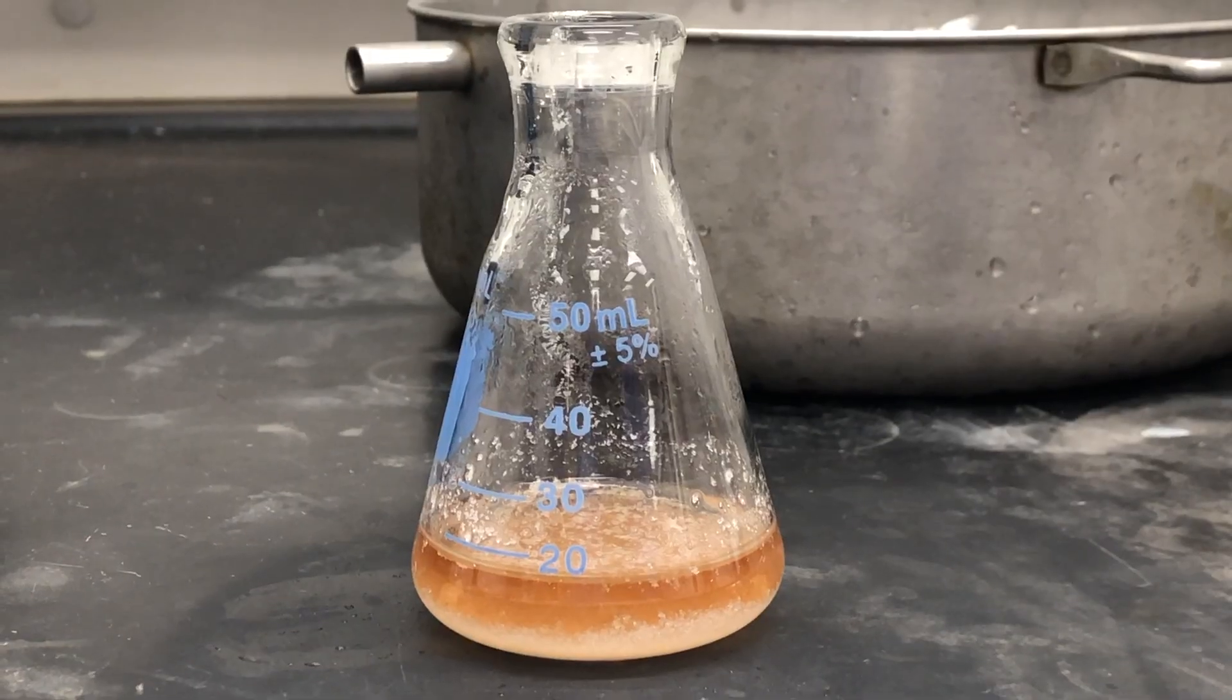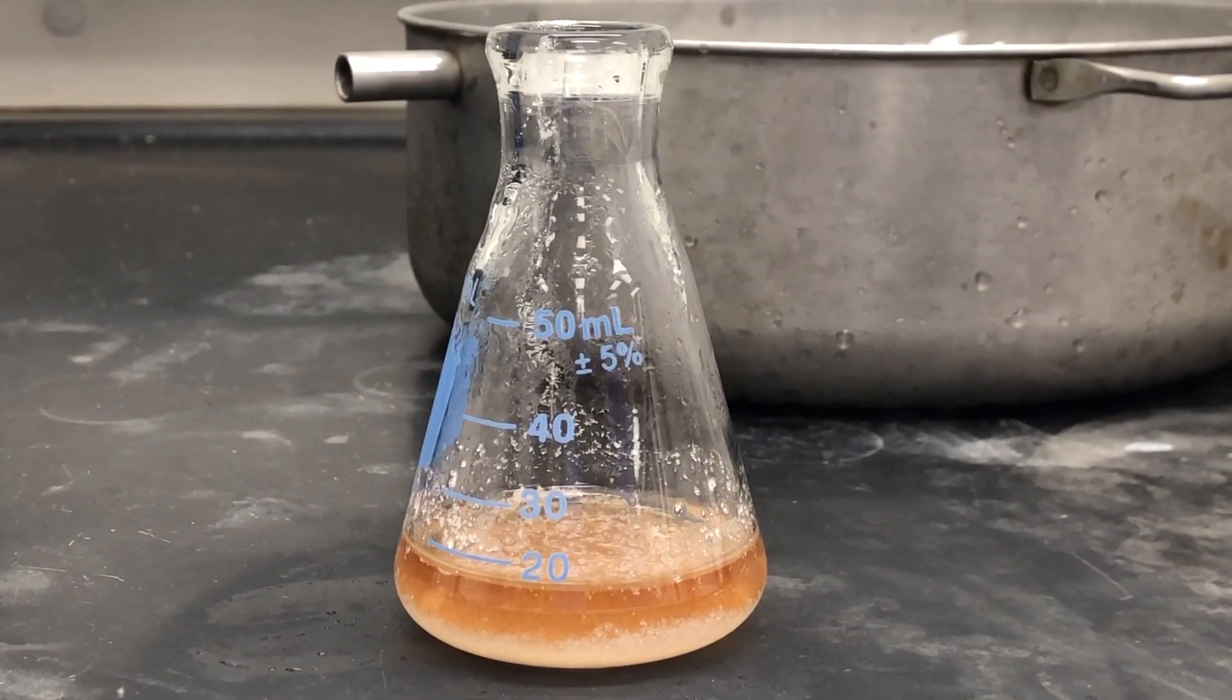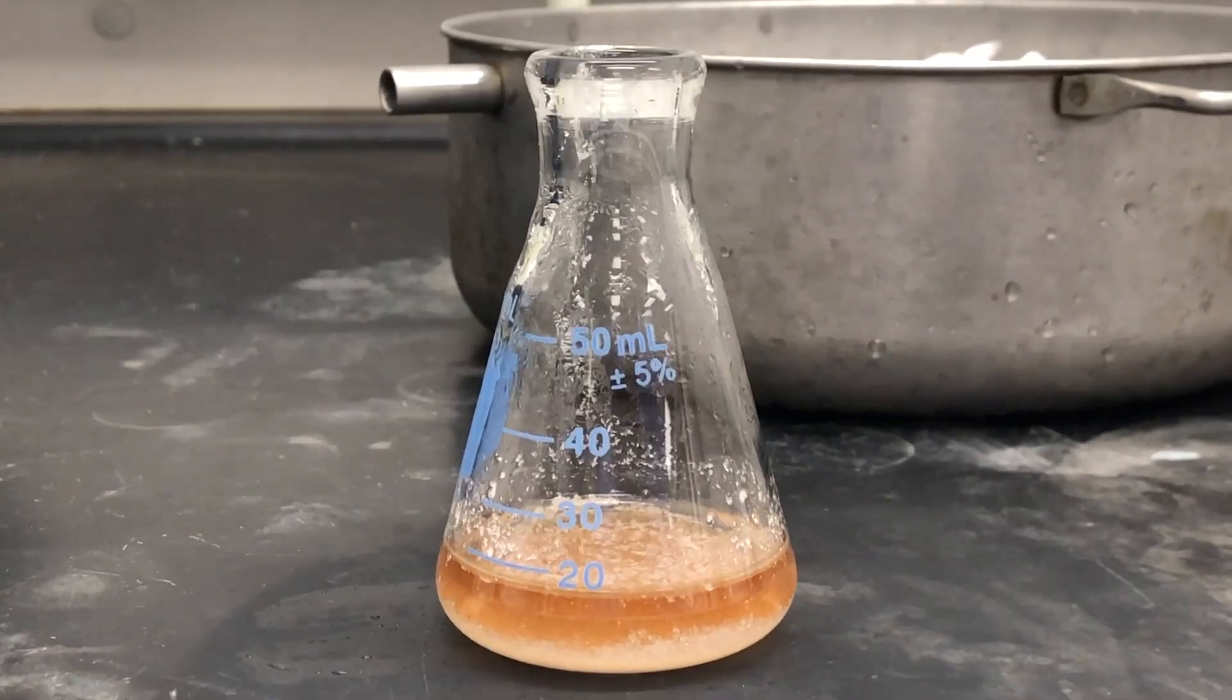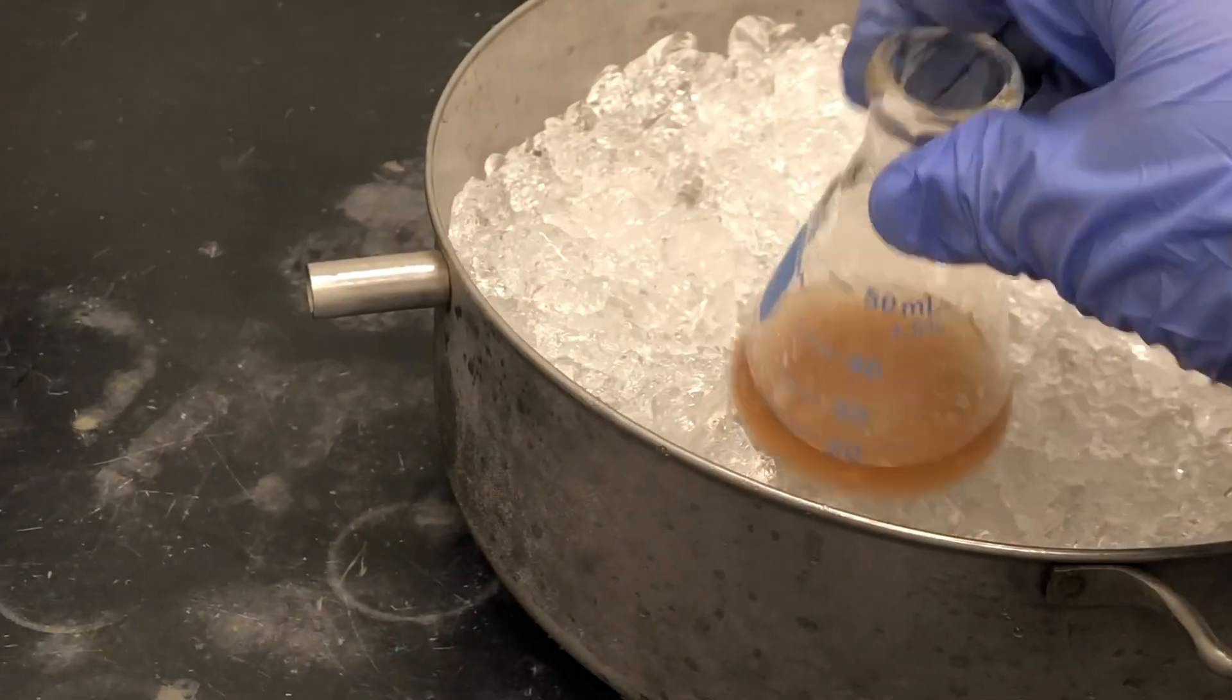The system is in equilibrium, so you want to make sure you allow it to form the product slowly. Now that it has reached room temperature, we're going to go ahead and take the flask and place it in an ice bath.